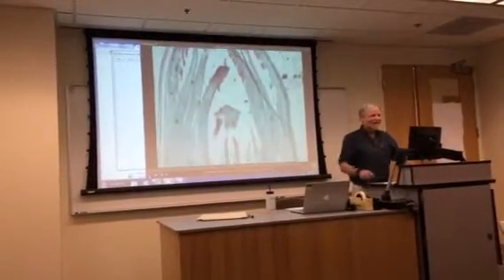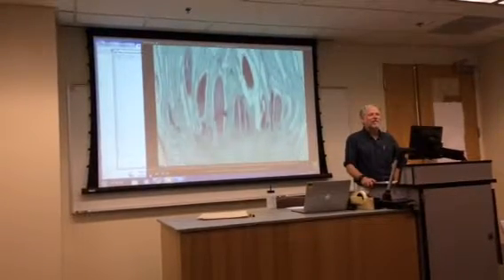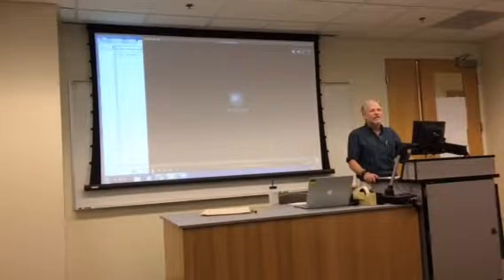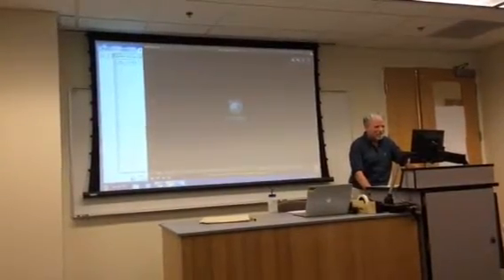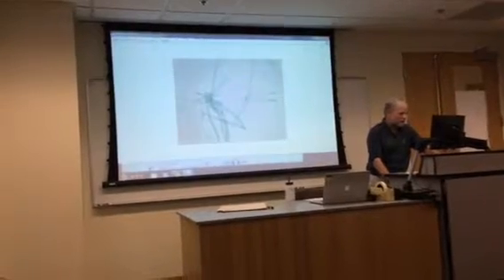DeVille. All right, here's the point. It's hard for me to show you everything you need to in one slide. These things are big, so we made this so you can see more of it. As you're looking at slides, you don't have to make a movie, but do move the slide around so you know what's going on there.